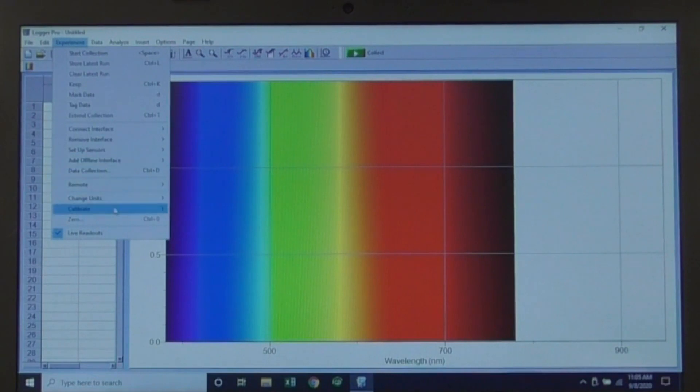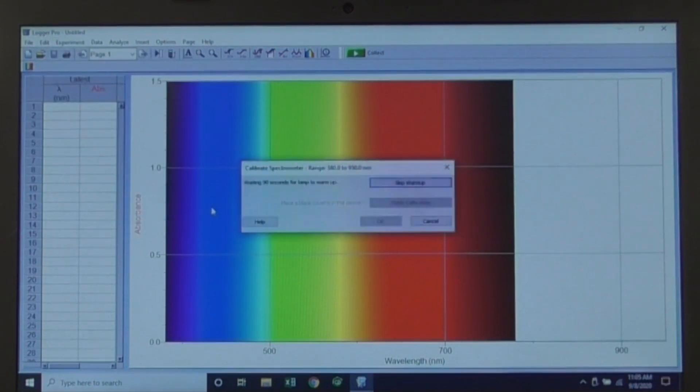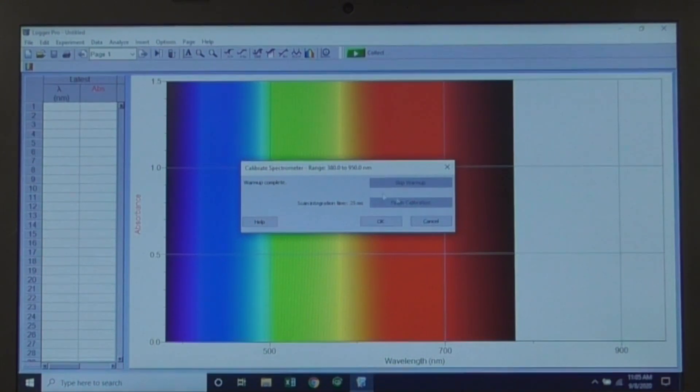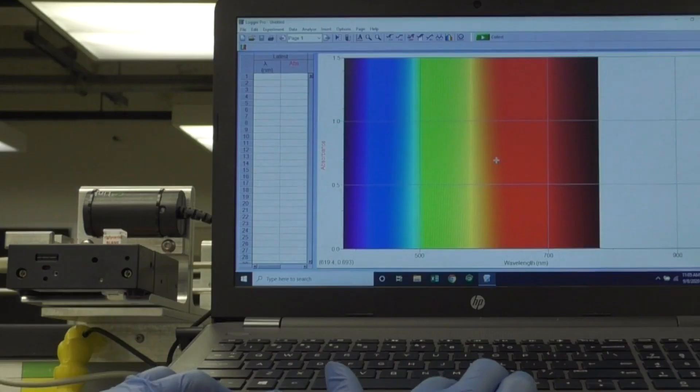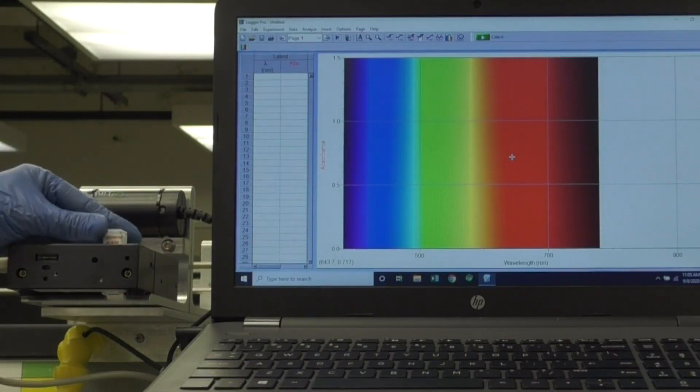Click Experiment, Calibrate, Spectrometer 1. If the spectrometer has been on, you can choose Skip Warm-up. Click Finish Calibration and OK. Place the blank back in the patient block.